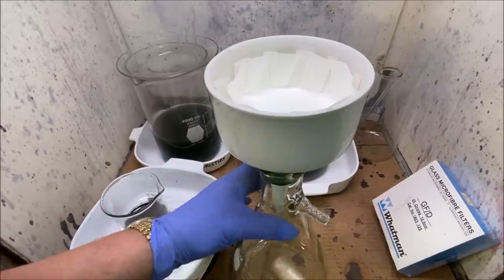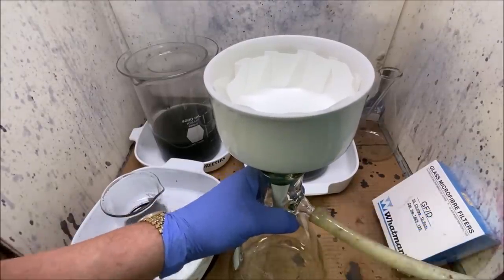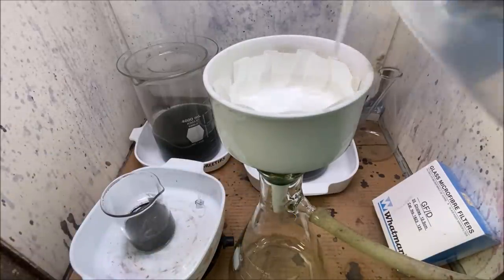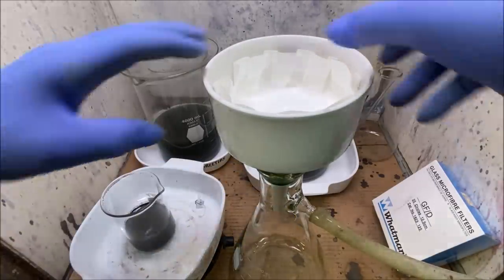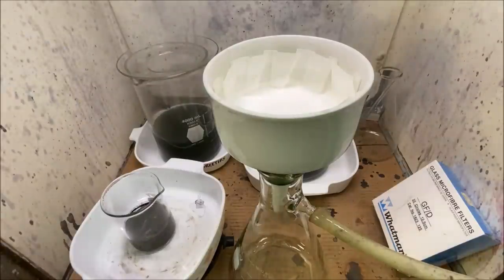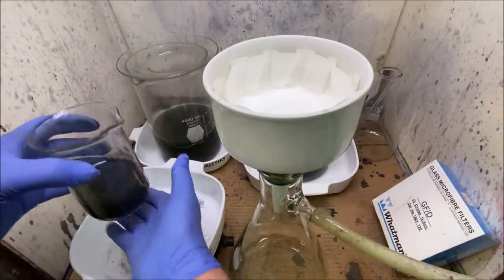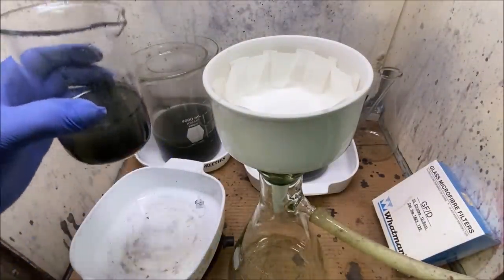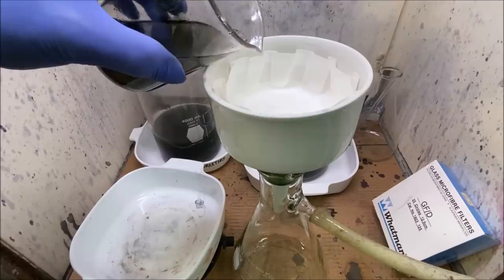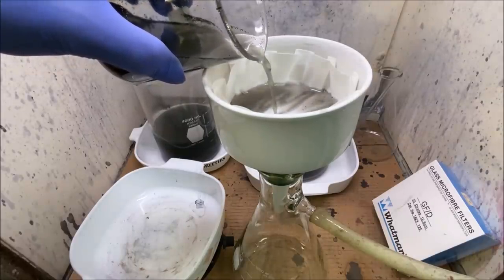I've turned on the vacuum to this hose here. Attached it to the flask. Gonna dampen our filter paper with some water. See if we can get this thing to seal up. All right, our gauge indicates that we've got some vacuum. Still fairly warm. It's dried off for the most part. We're gonna go ahead and pour it in now and see how this is gonna work for us.